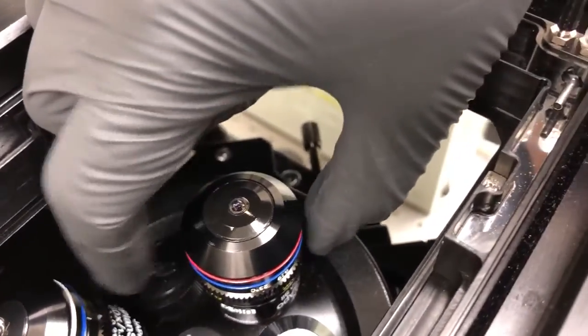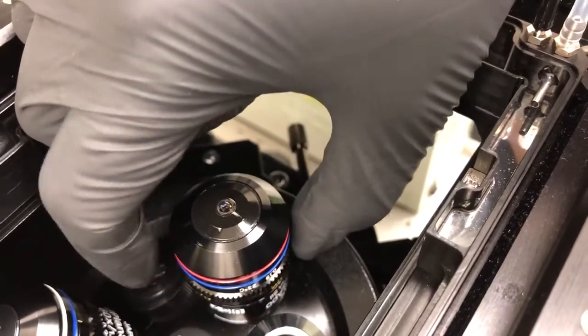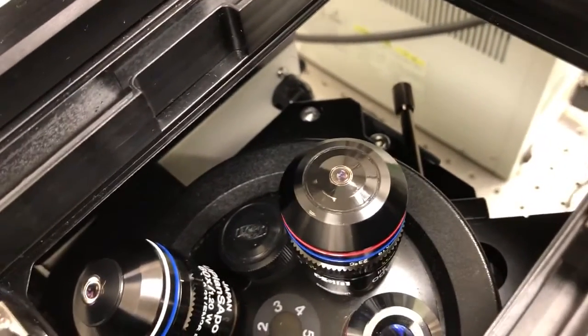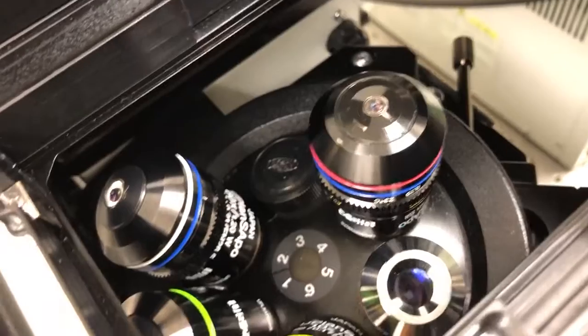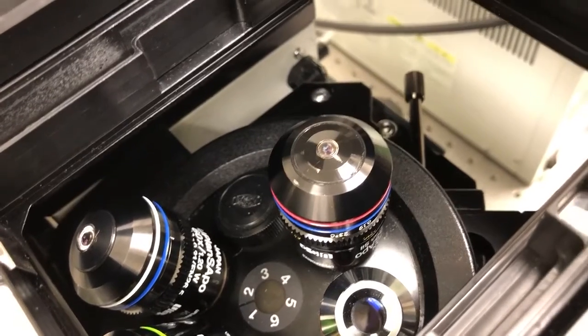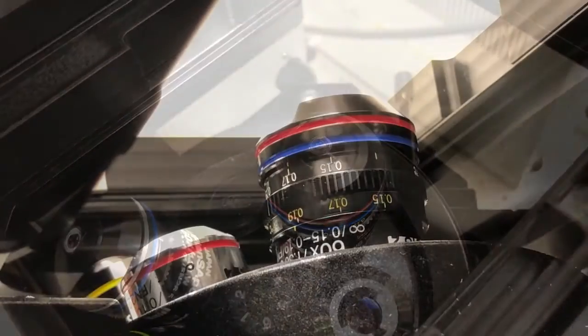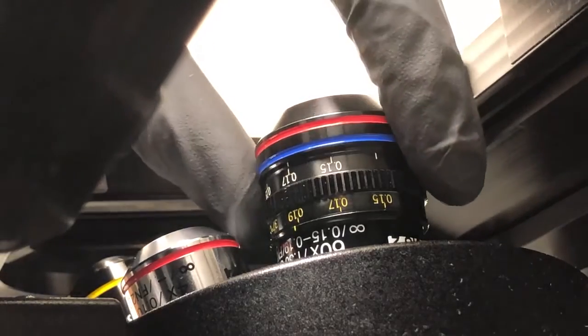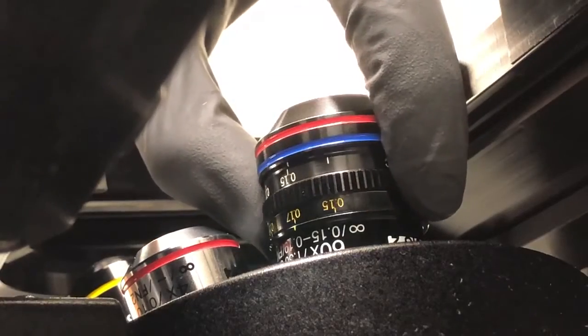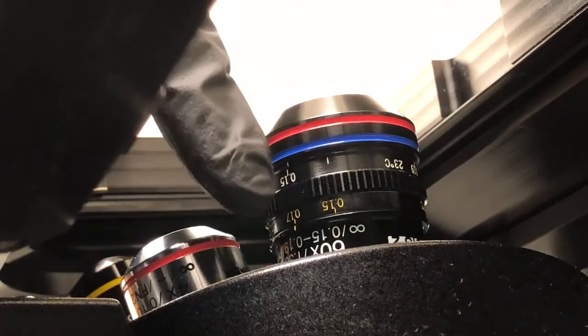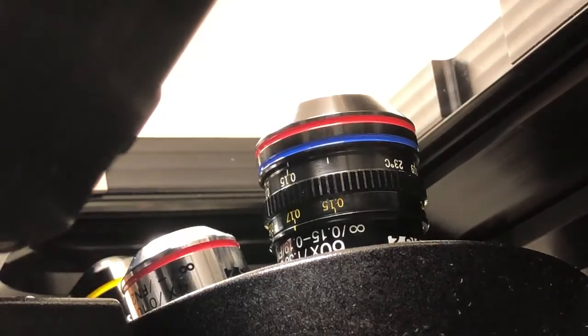And now we need to reach in and twist, turn this correction collar until the setting that we want is in place. And so the setting that we want is 0.17 at the 37 degrees, which are the yellow markings. I've placed the camera at an angle that you can see a little bit better what I'm doing. I'm going to put my fingers in here and turn that correction collar until the 0.17 is aligned in the orange side, so for 37 degrees.